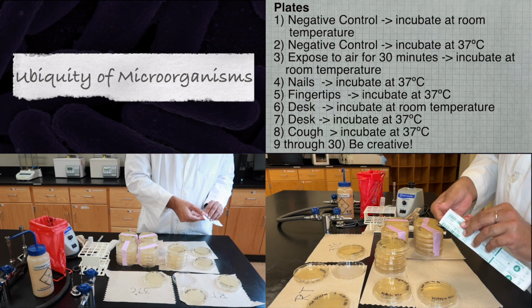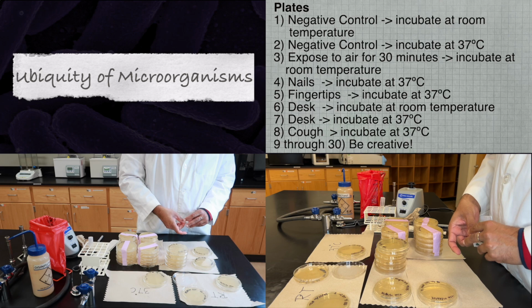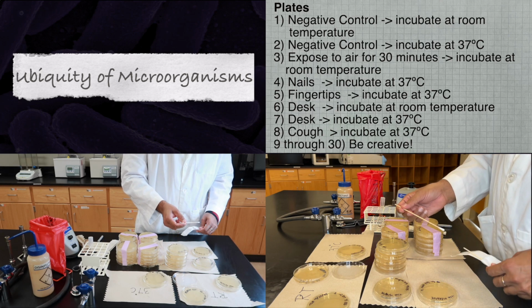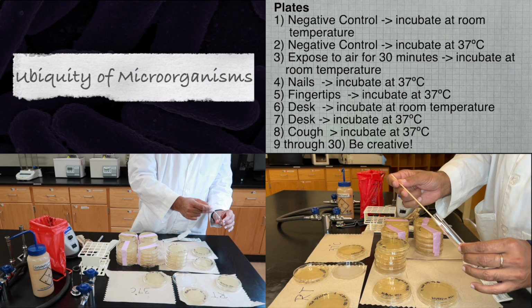Plate number 4, a student will be taking a sample from their fingernails. In order to do so, please open a sterile cotton swab. Then dip that sterile cotton swab in sterile water.